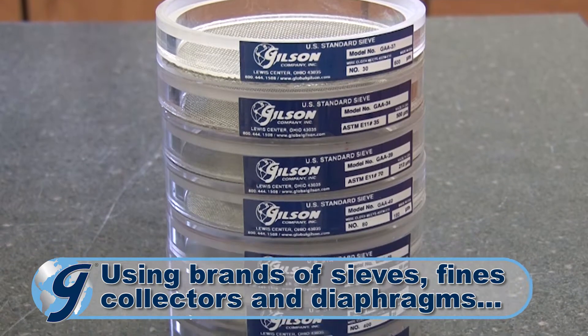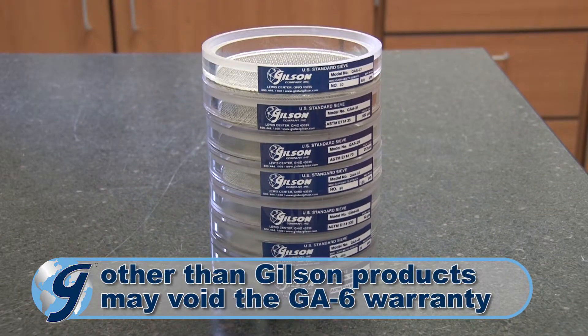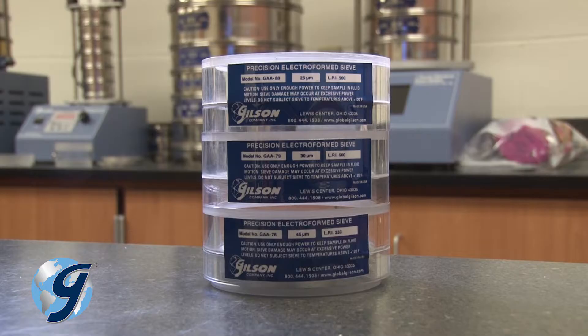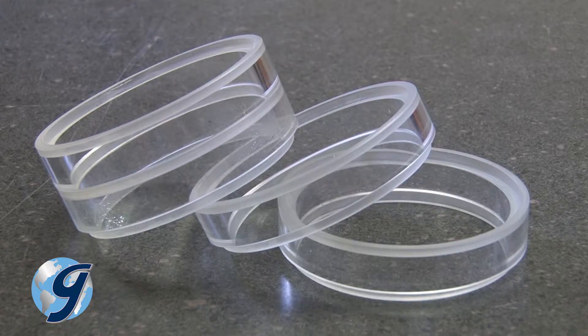To begin, select desired sieves for testing. The capacity of the sieve stack assembly is seven standard sieves or three precision sieves. When using fewer sieves, spacers must be added to maintain the correct height for proper operation.